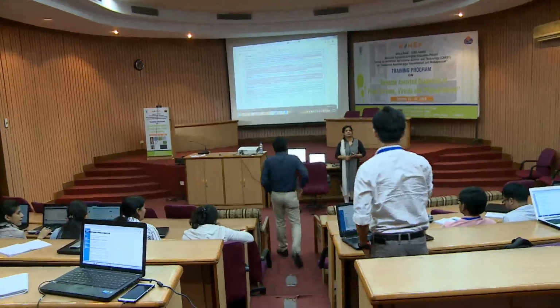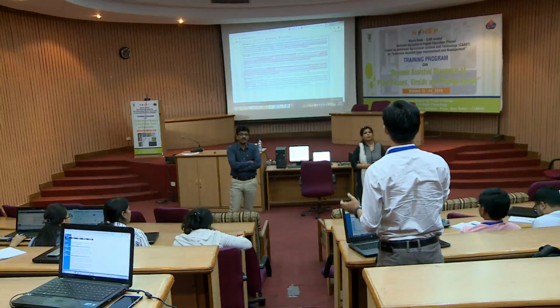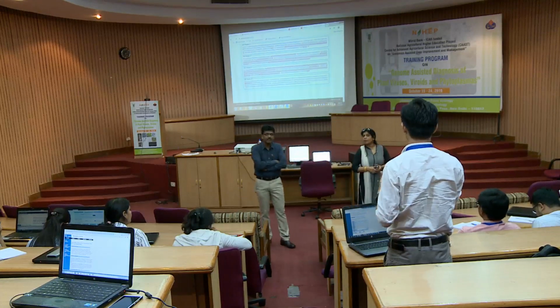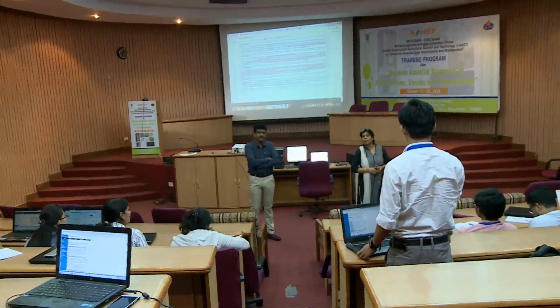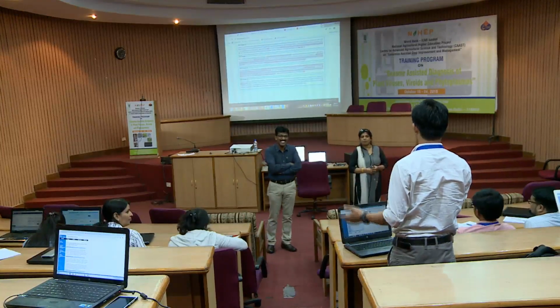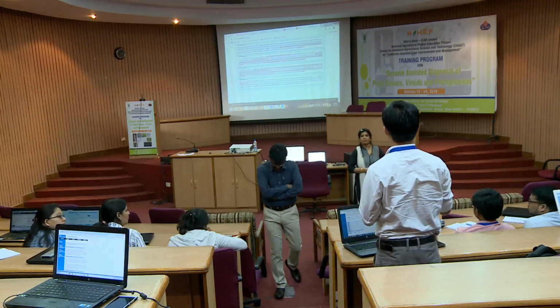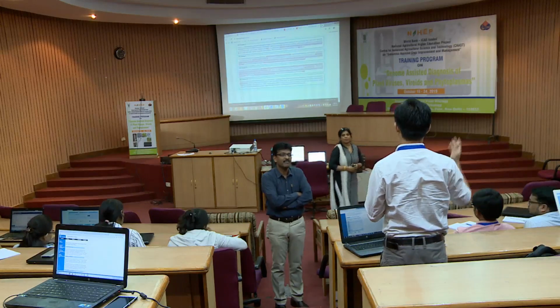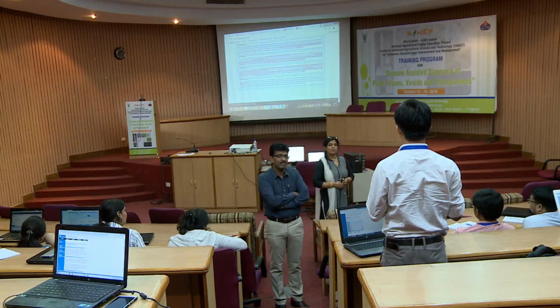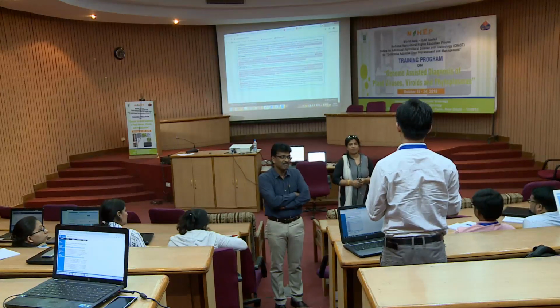Thank you, ma'am. Myself Neelam Washington, I'm doing my PhD third year. My question is, we all know that NCBI has a very large database with so much data, and there are a lot of junk files, because it's very easy to put any file in the database. So when we are doing comparative analysis, taking sequences for a phylogenetic tree, for viruses or any sequence, how will we know where the sequence is coming from, how correct it is, or how good the sequence is?